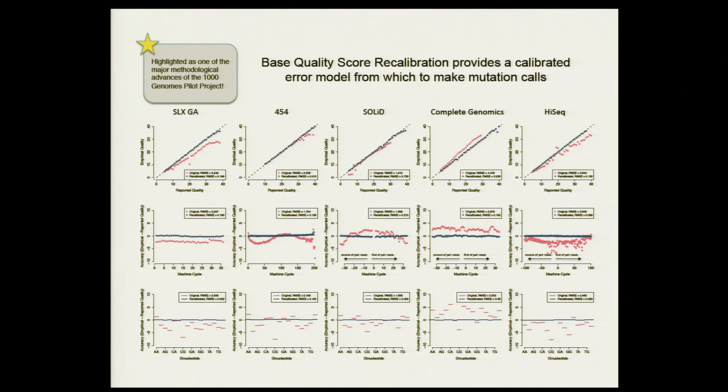What's up? So you compare to the reference sequence. Is the reference sequence also sequenced based on one specific technology? Does this affect the results that you got? For example, maybe there is some systematic error in that reference sequence too? Yeah, I see what you're saying. But the reference is quite different, right? It's a consensus built by this highly accurate Sanger assembly. I suppose there is some systematic bias there that you're picking up here, but I don't think it would account for these crazy differences in read length and things, right? Maybe there's a bias by sequencing dinucleotide context, but by machine cycle, it seems a little odd, right?